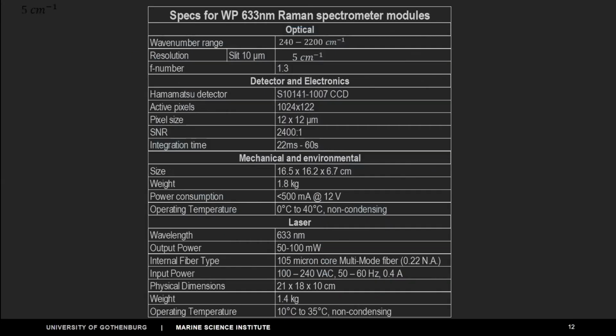And this is what we managed to get after looking at different companies, what they offer and what we want to get from a spectrometer and the Raman system. These are the technical aspects. And of course, the resolution is quite good: 5 per centimeter, and you can go down to maybe 4.5 to 3 from the small, tiny systems. If we have a massive benchtop one in the labs, you can go to 0.1. But that's difficult to take onto an underwater platform. The resolution can be fixed a bit with the slit size, so on that we can work.